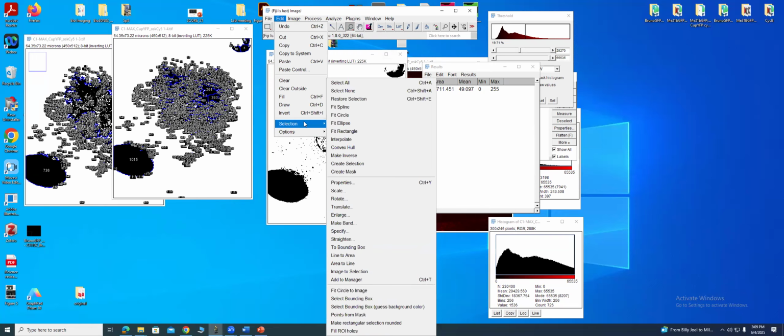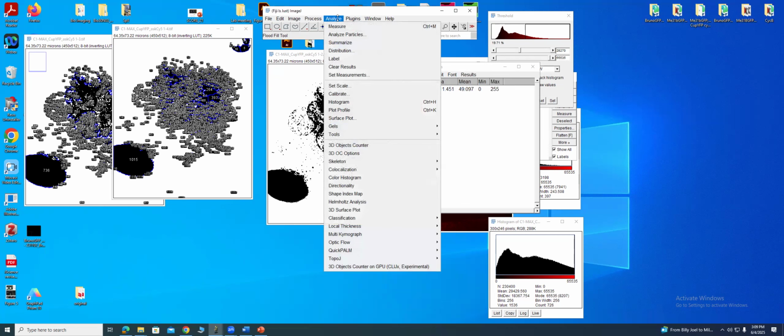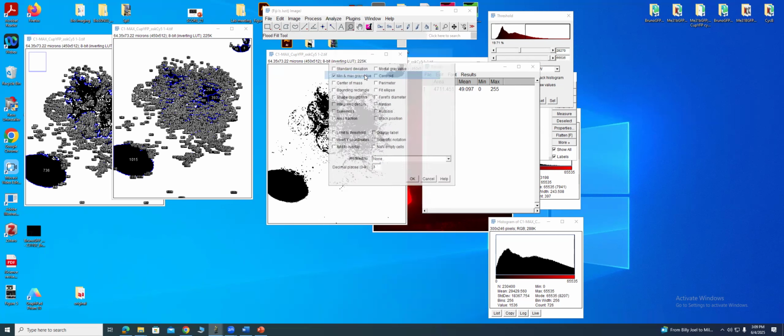Sometimes I'm blind. One second. Set measurements. Okay, hold on one second. Analyze, Set Measurements. Sorry, it's right here.